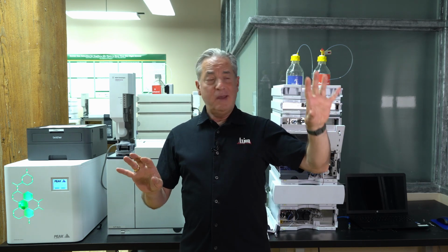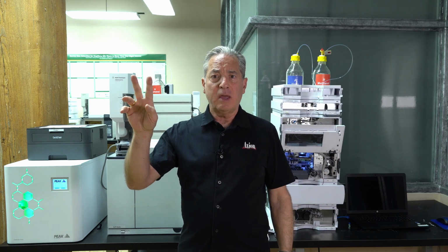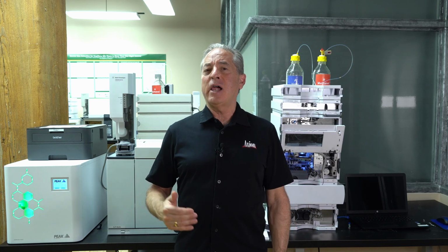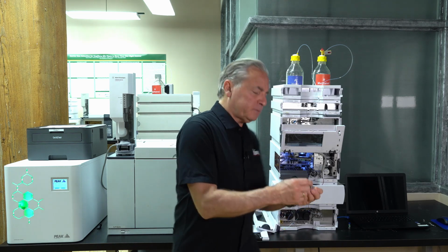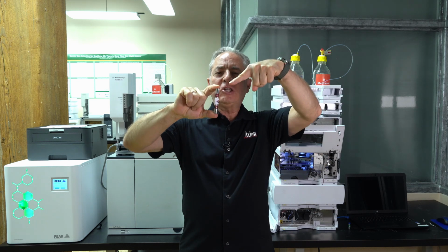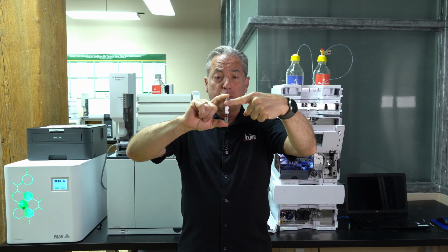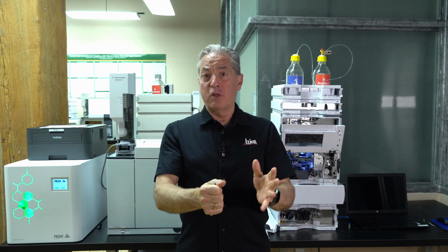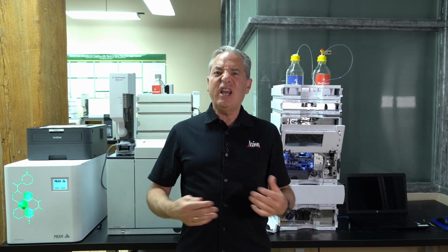So retention time is simply measured in minutes. Capacity factor, retention factor, both the same. Two different words for the same thing. And that is how long your analyte has spent on the column relative to the mobile phase. So if you think about it, if I have an HPLC column here, even a nice short column like this, when you make an injection on the top of the column, the molecules just can't appear at the bottom. They must travel through the column at the speed of the mobile phase. So it takes a certain amount of time for the mobile phase to travel through, and anything after that is the amount of time the analyte spent in the stationary phase.